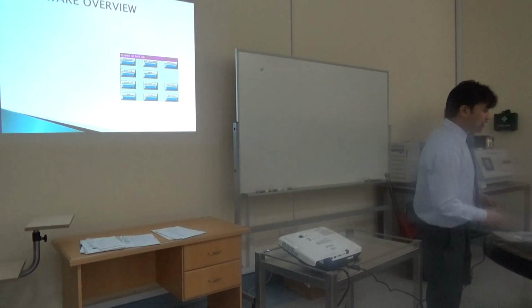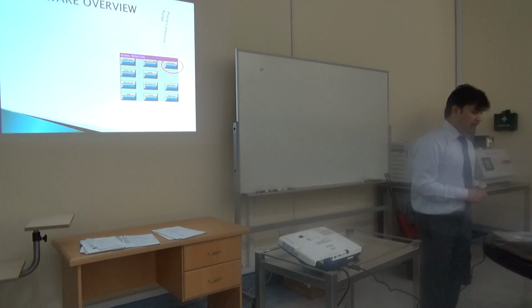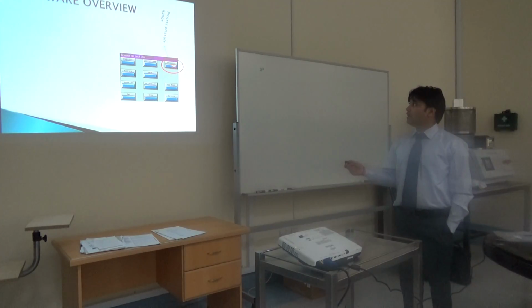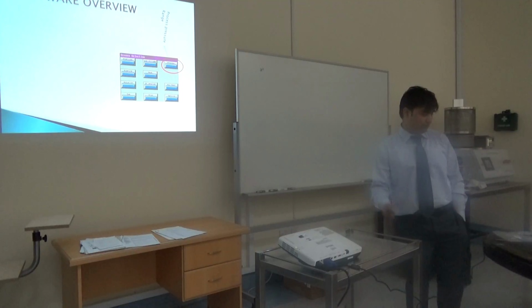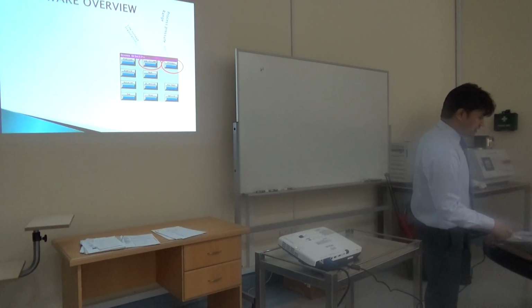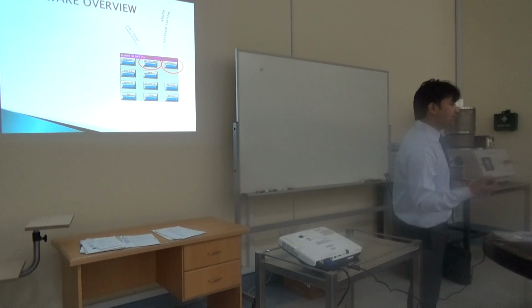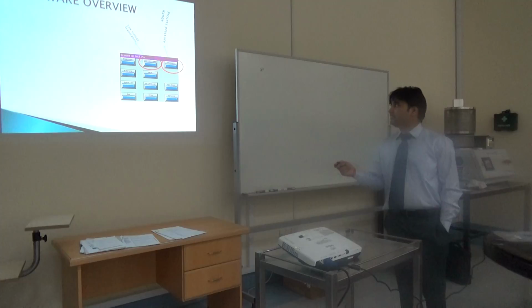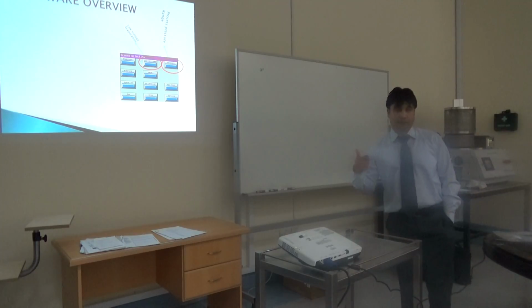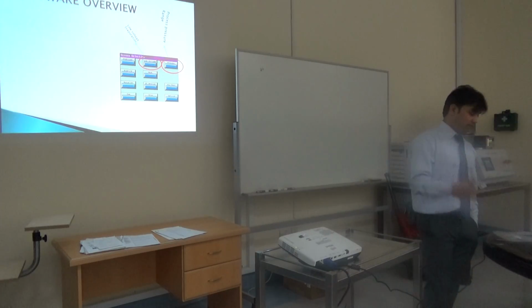In the next slide, we are going to discuss the second screen, which I brought in the last slide. First, about the process. Here, if you touch this process, then we can see what is the starting process and what is the pressure we need to maintain here. Second, this is called the low voltage evaporation system. This is also called the DC evaporation condition. We are going to use this low voltage technique in our process.